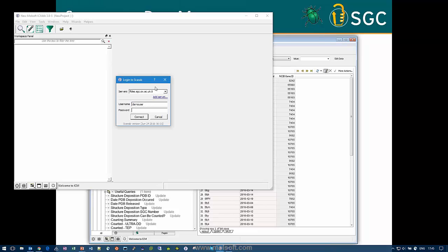So this is what it looks like. Here you see I have the server that I connect to, and I'm going to put the password in. I'm not going to use the production server to show you the editing, because that would be crazy. I could probably get away with it, but you never know. So what we have here is a demo database that has very little in it, but I can do evil things to it, and it won't be a problem. So I just wait for this thing to fire up.